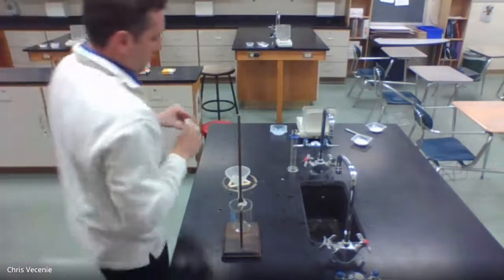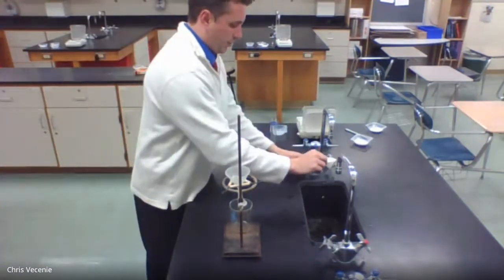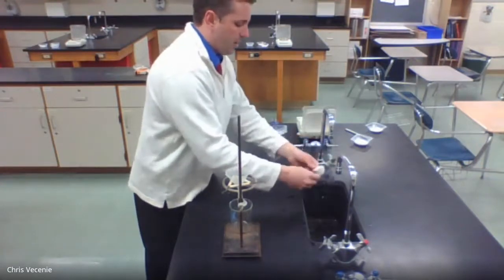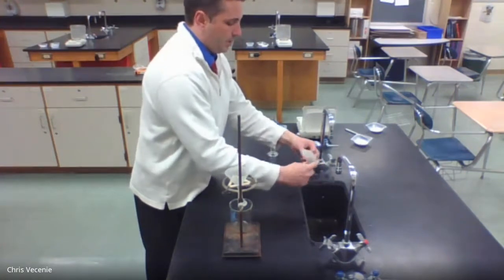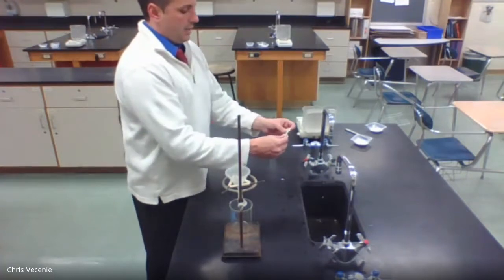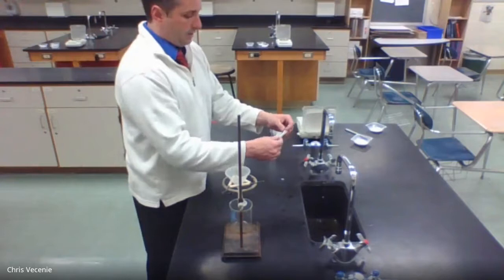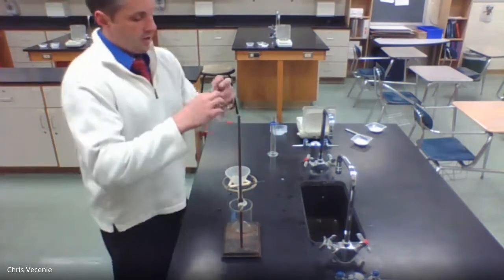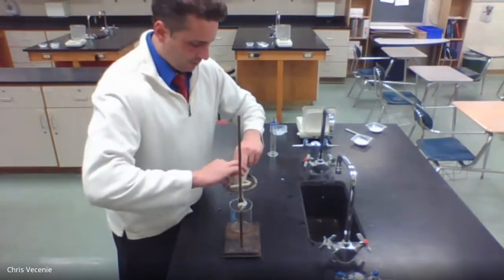All right, so to help it stick to the funnel, all I'm going to do is run a little bit of water through it. And like I said, I don't really care that that happened because the whole idea is I'm going to eventually put it in the oven. And when I put it in the oven, I am going to evaporate off any of that water that was there. So I go to one of my filtering windows and I put it inside my funnel.